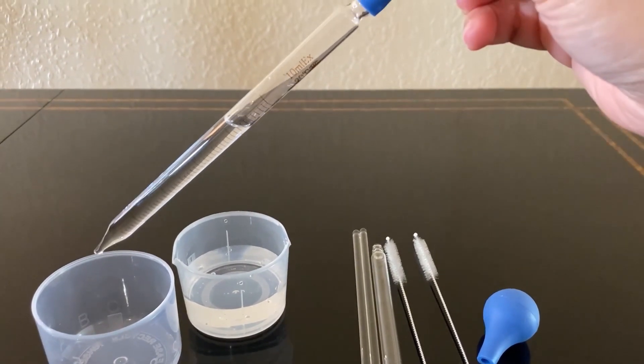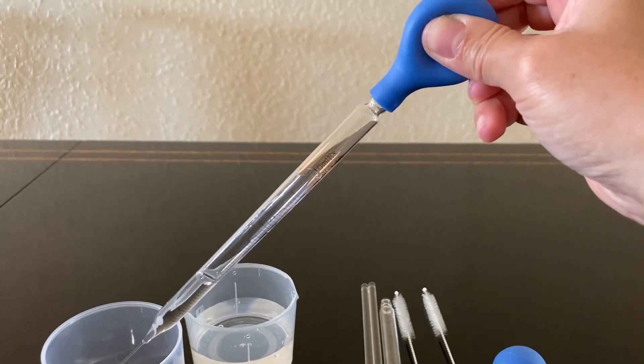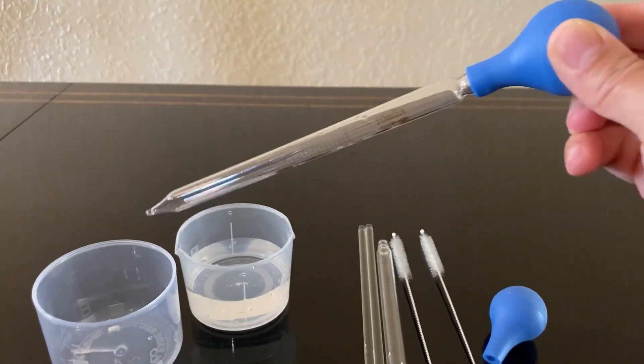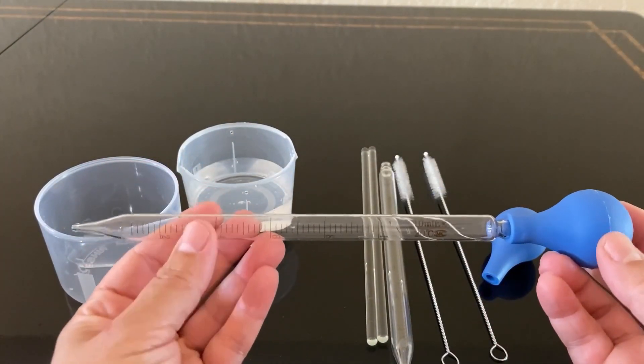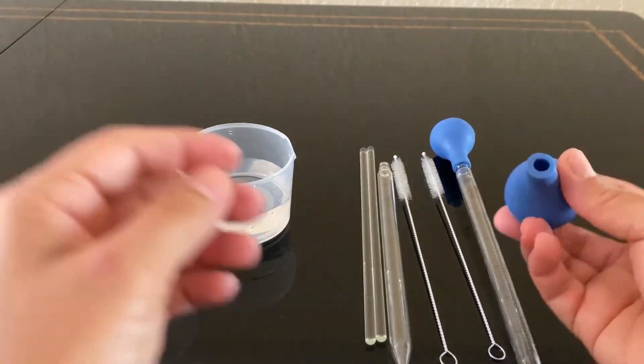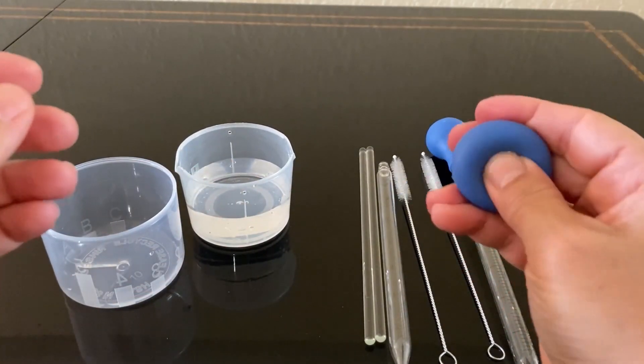As you see here, the glass droppers are made from high-quality borosilicate glass. Our rubber caps here are made from high-quality rubber. These secure the top of the dropper, preventing spills and leakage during storage.